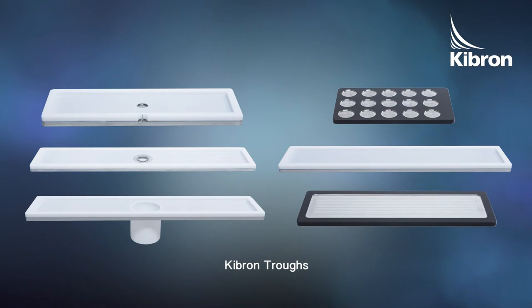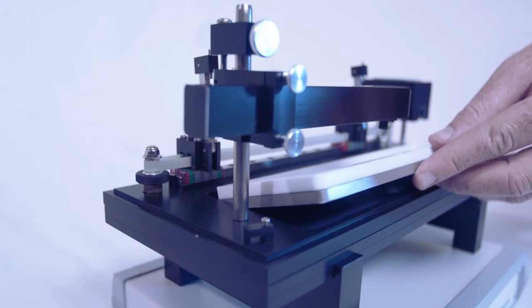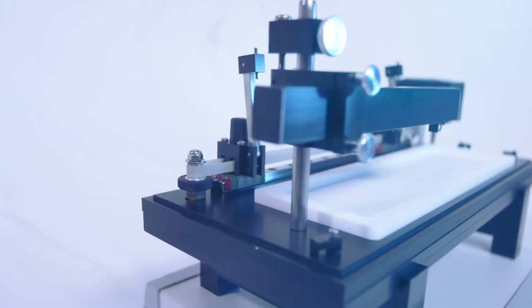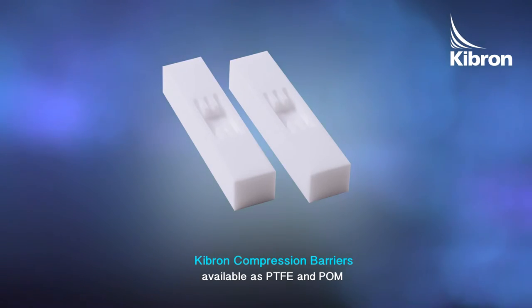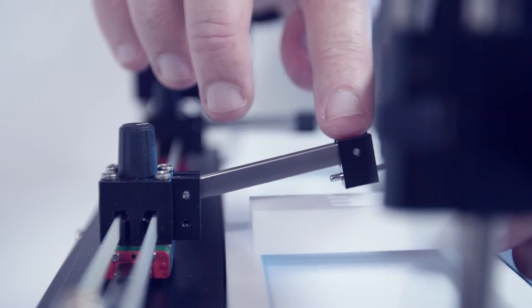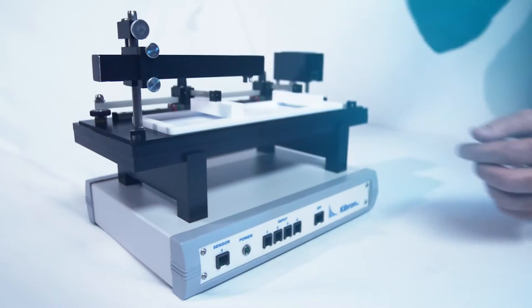Kibron troughs are available in a range of different materials to suit your experiments. The troughs are interchangeable for different substances and applications. The molecules in the film are confined on the sub-phase surface by the barriers and the trough edges. The surface area of the trough can be varied by moving the barriers.